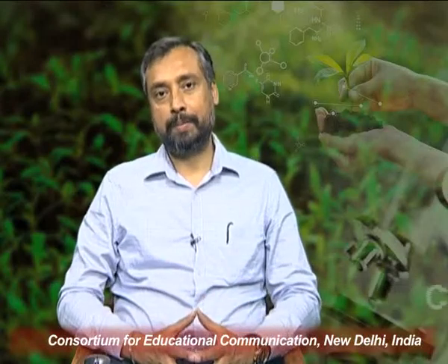In our previous lecture, we talked about two fundamental types of microscopes, that is light microscope and electron microscopes. We also understood the various comparisons between them, the limitations of light microscope and electron microscopes, the advantages and disadvantages of light microscopes. We have also seen the various fundamental elements which are used in any microscopy.